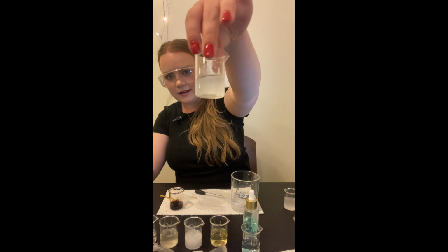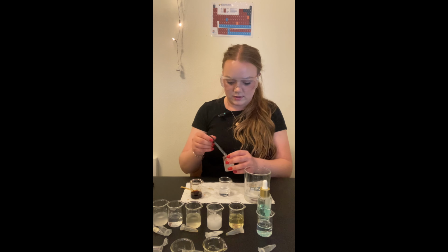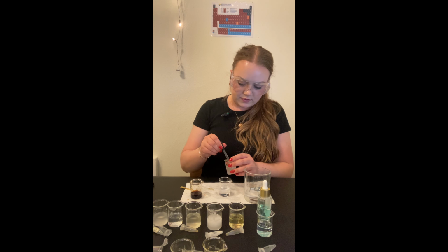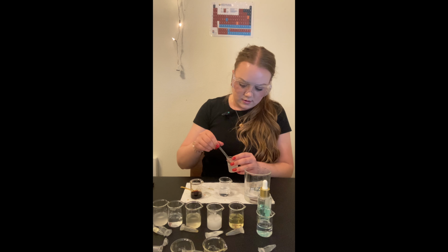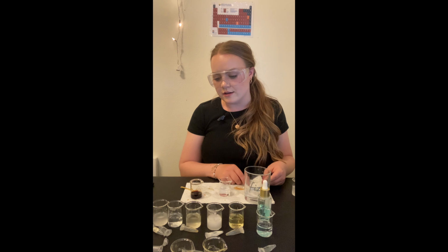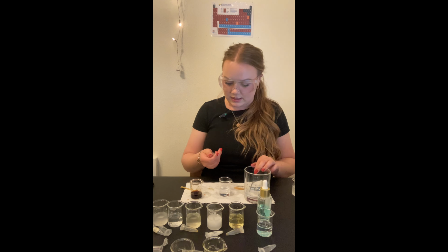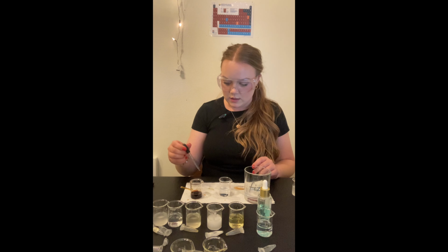You can see as it's settling out that it is a clear solution. I love being a chemist and just pouring things perfectly. It's like the best feeling. So the IT Cosmetics also contains the active form of ascorbic acid. So we will see how this performs.